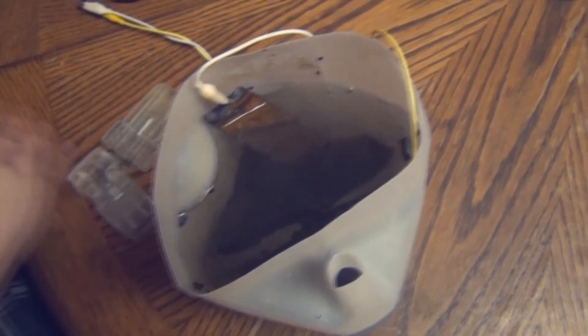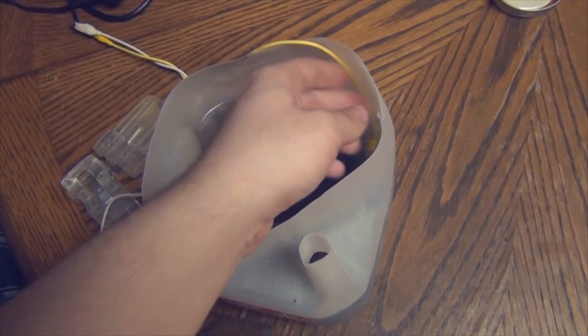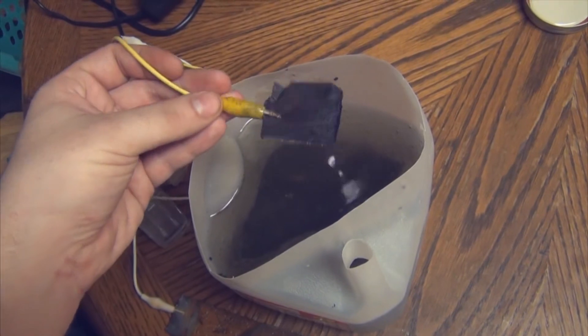When you pull out your graphite electrodes you'll notice one piece has rust on it. This means the graphene produced is contaminated with rust and we'll have to remove that using diluted hydrochloric acid. As you can also see, the other electrode is completely eaten away.